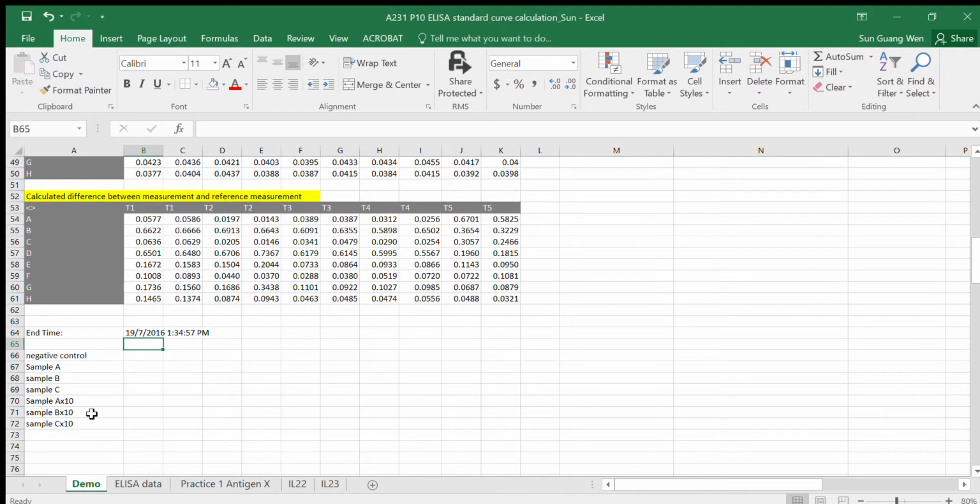The first step, you should identify all the data. I have identified all the data sets here. Then I'm going to type the owner of the data: team 1, team 2, team 3, team 4, and the last group, team 5, performance standard.